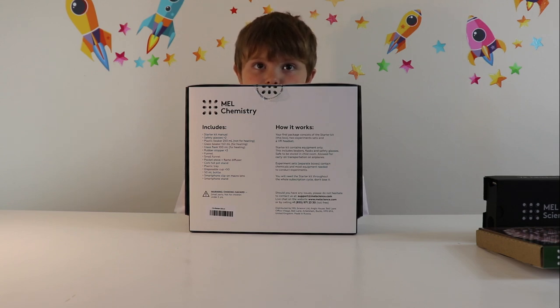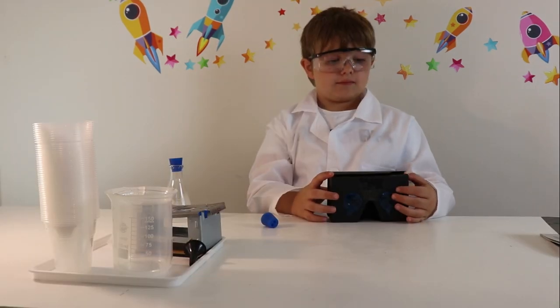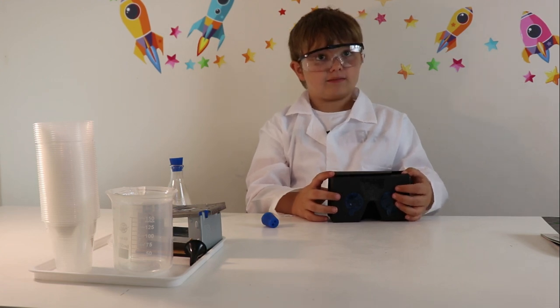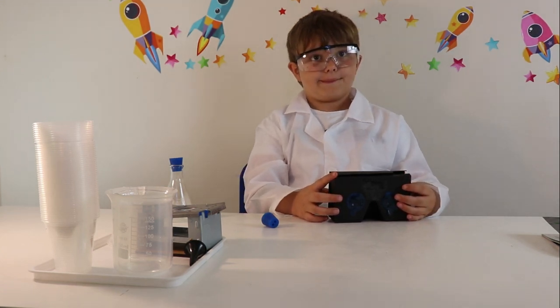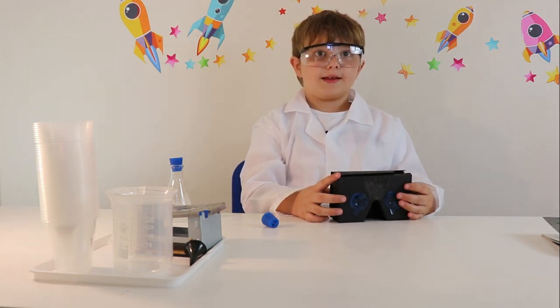A smartphone clip-on macro lens, which I can't wait to use, and the smartphone stand. We have unboxed all of the items that were in the starter kit, and we also get a virtual reality headset!